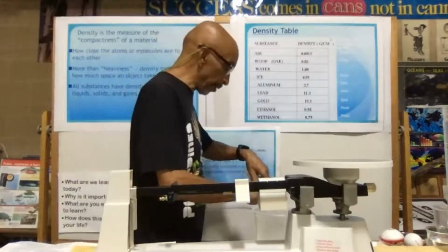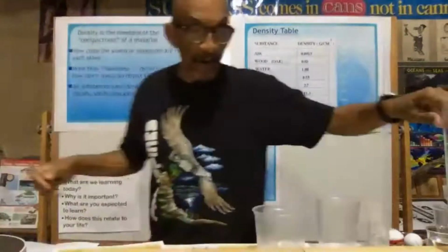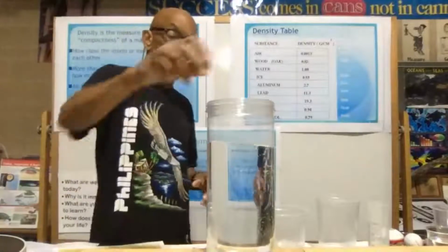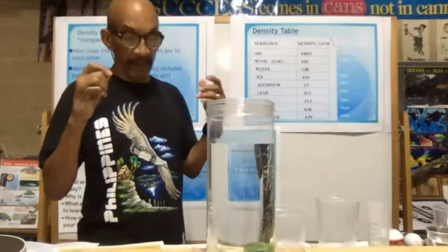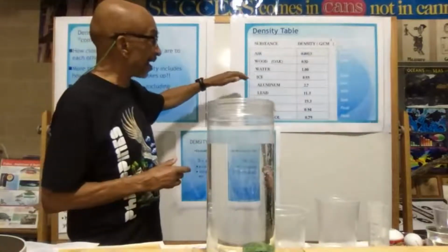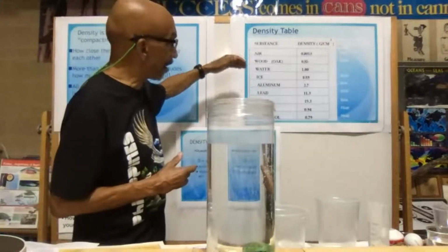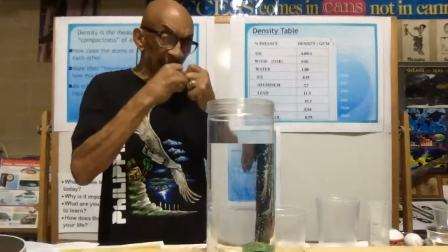So what I'm going to do, I'm going to get the marble, and I've got a container here. I'm going to take this balance down. I've got a container here that has water, which is at 1.00, and I'm going to put the marble in. Did it float or did it sink? It sunk. So what that means is that the marble has a higher density than the water, because the atoms that are making up that marble are really, really compacted together real tight.